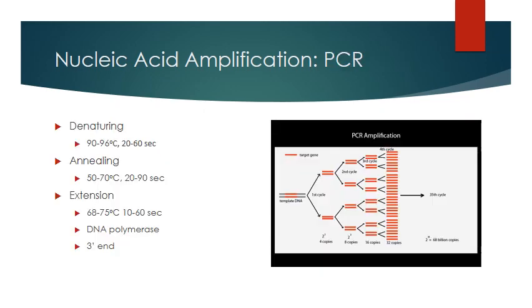For the PCR itself, which we're finally at now, how do we perform PCR? The things that you need to remember are the three basic steps, or the three elements of any PCR cycle. Those elements are going to be separated from each other pretty easily, actually, by initially temperature. Temperature is one of the most important differentiating things between these steps, and then of course time.